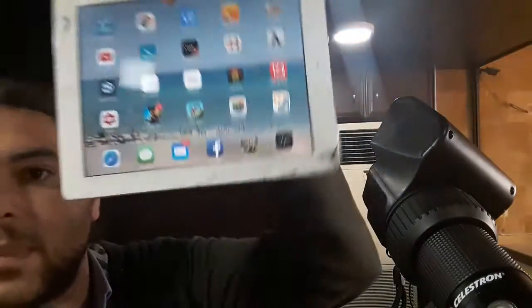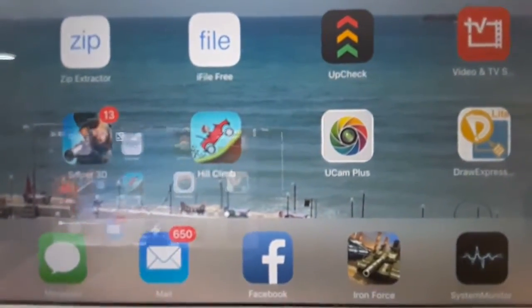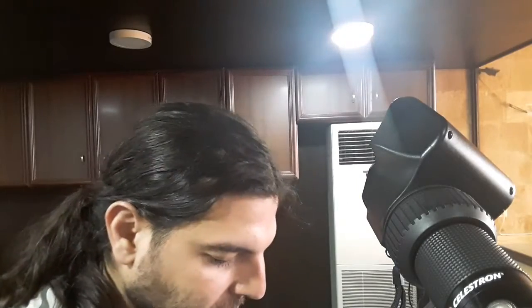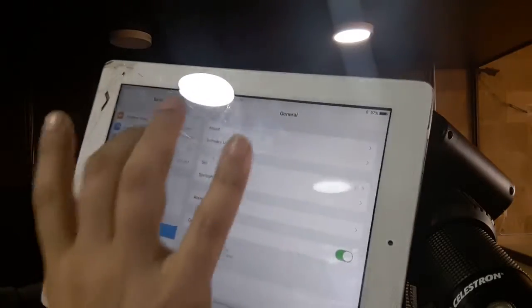I'll show you both the iPad and the Android. The iPad is the same as the iPhone — you just install the app. The app is called uCam Plus. Before opening it, you have to connect to the camera, so go to your phone's settings and then to the Wi-Fi section.